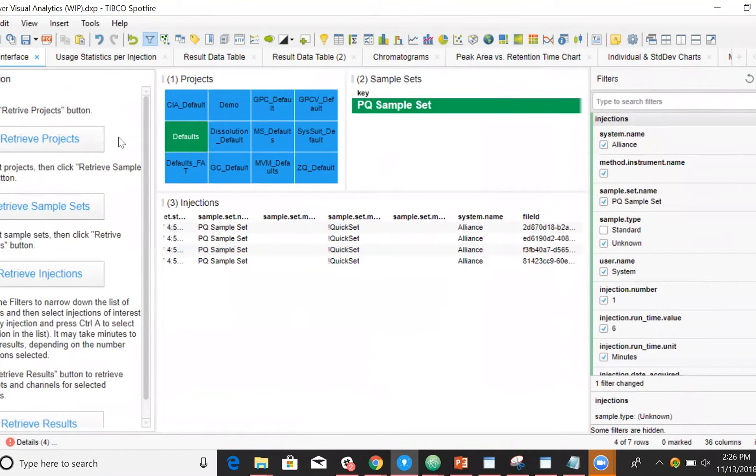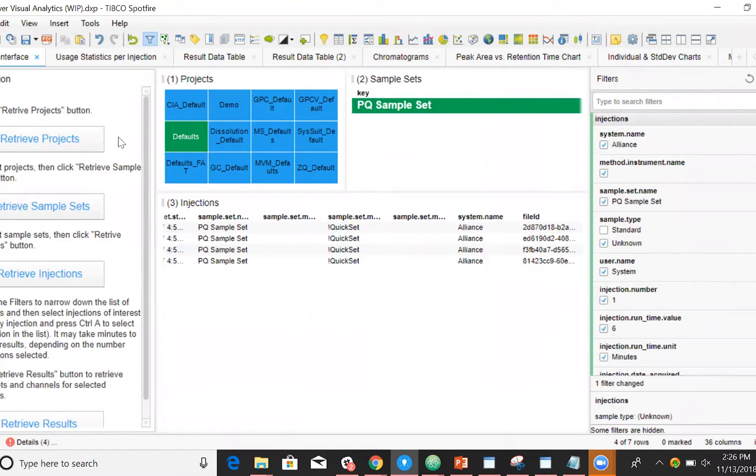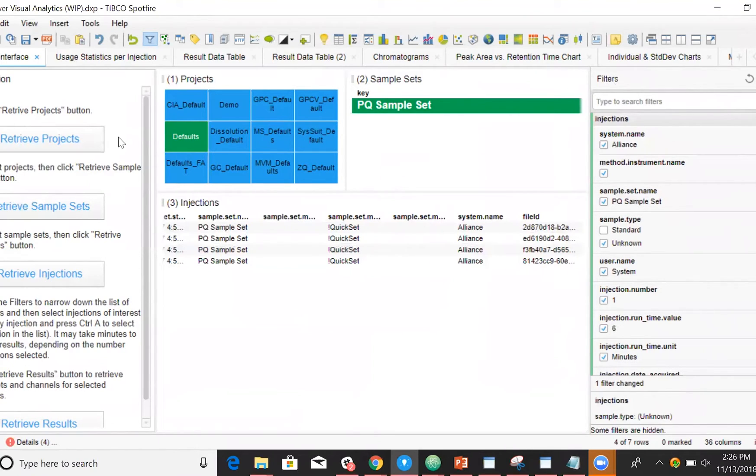Finally, let's take a look at our Empower data within Spotfire. Remember, this data has been standardized and automatically prepared for these visualizations. Here, we're looking at a report template created in Tibco Spotfire.